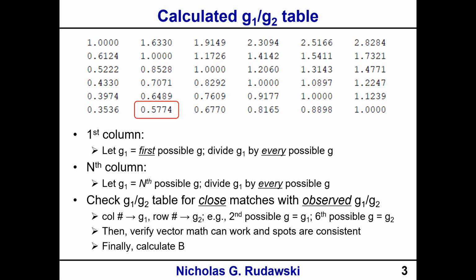So that's just a very brief reminder about the indexing process that we used before with the cubic crystals. It's no different when we move to the hexagonal crystal in a lot of ways. There are just some additional nuances, but we're going to use the same methodology of finding orthogonal G vectors, then calculating a ratio, and then calculating this table. That's not going to change.